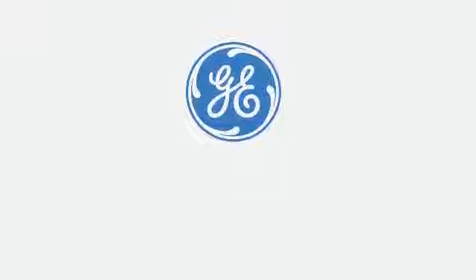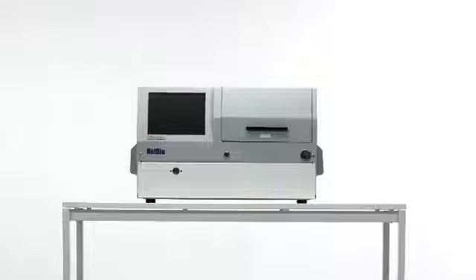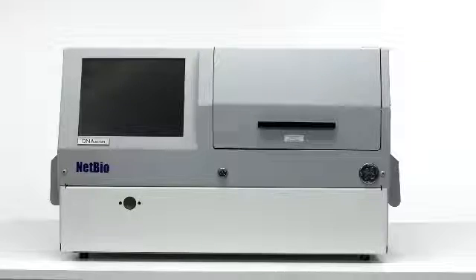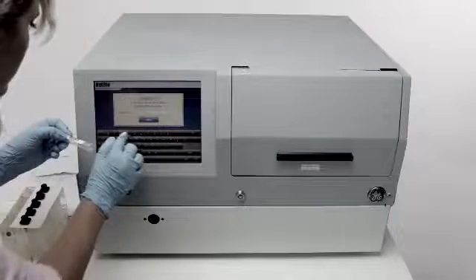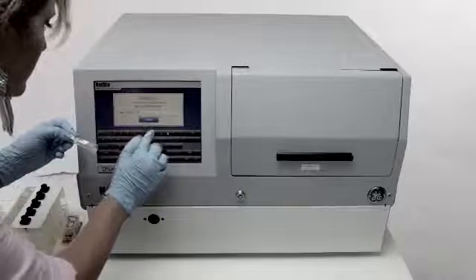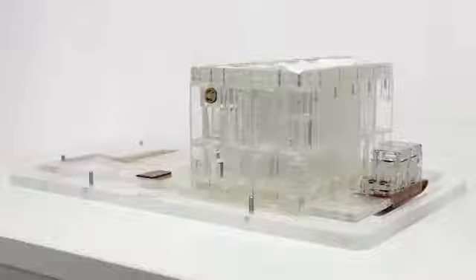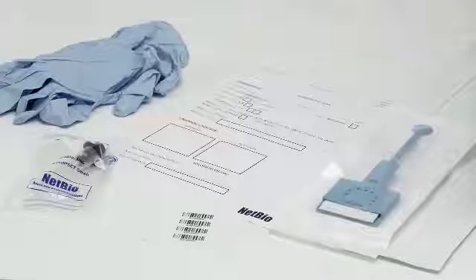GE Healthcare Life Sciences has partnered with NetBio to introduce the DNA Scan Rapid DNA Analysis System, a compact, fully automated rapid DNA system that analyzes DNA in less than 85 minutes. The system is designed for use in police booking stations or forensic laboratories for the analysis of reference DNA samples only. It is used with two accessories: the DNA Scan Biochip Set Cassette and the DNA Scan Collection Kit with NetBio collection swabs.